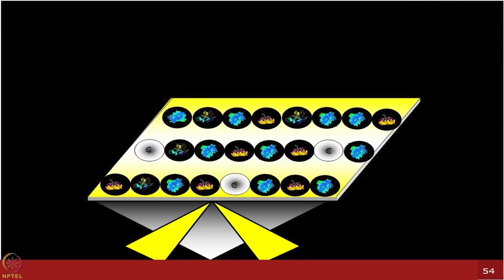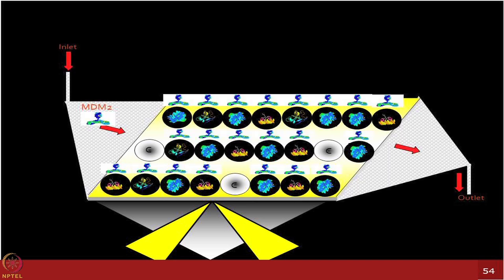The next experiment planned was more of a high-throughput experiment, which was very challenging to do on the prototypes we had available. One of the companies in Cambridge at that time gave a lot of clones of p53 mutants. These are all hotspot mutants of different p53 regions, to test how the MDM2 protein binds to wild type p53 versus different mutant forms of it.